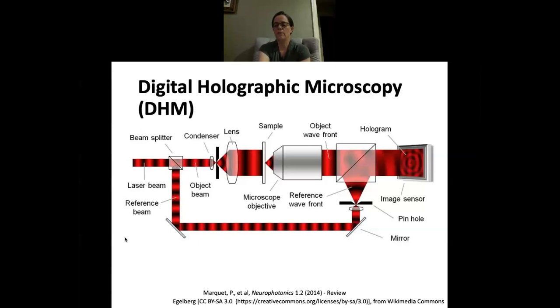In holographic configuration, the microscope is introduced into the object arm of the optical interferometer. The interferometer has two light paths split from the same coherent source. That is to say, this microscope method uses a laser rather than an LED or a lamp source.